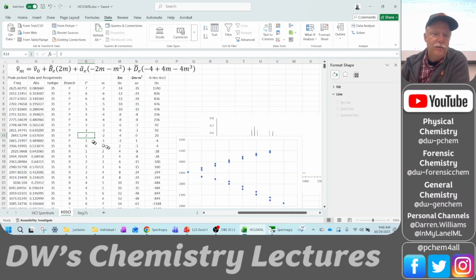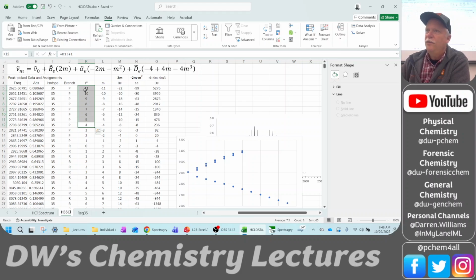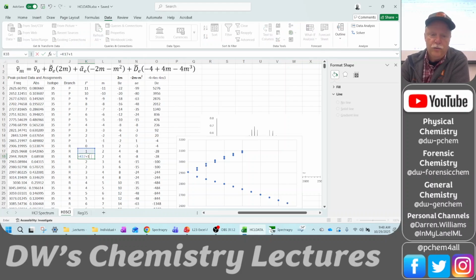See, all of these are doubled, so we're just going to make sure that we don't have the wrong J values. So this is equal to the one below it plus 1. So that's P4 all the way up to P11. And I remember that from an earlier table. So it was because I had formulas in these values. So this is R0, R1, and this should equal this one plus 1.